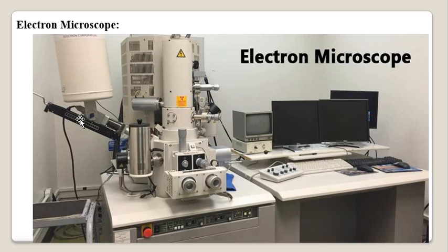So as to avoid this, the fluorescent screen is attached to the electron microscope so that we can view the image on the screen directly. The screen is coated with a chemical which by its excitation forms the image, as on a television screen. So these screens are used as part of a magnification system to observe the magnified image of this electron microscope.